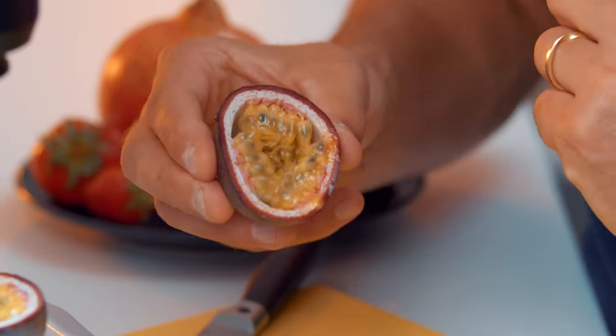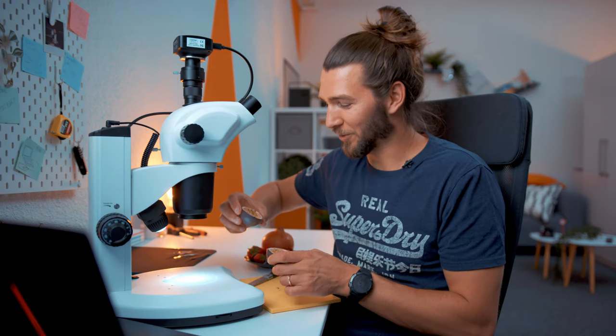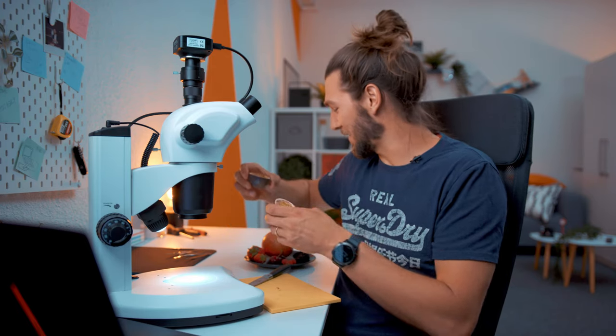We made a video about nail polish, go check it out. On one of the inner skin layers — the white layer — you can see a lot of texture and bubbles and structures connecting to each other to protect the fruit and keep it damp. If you squeeze around here a little bit you can see how it's dampening and protecting the fruit inside — a little bit like a sponge. We'll save this one for later.